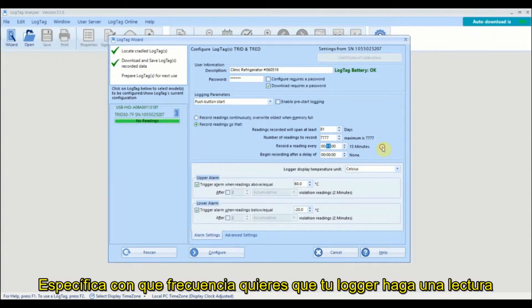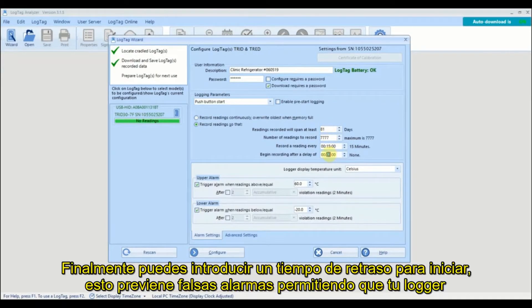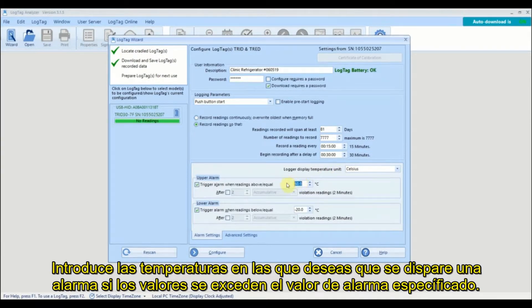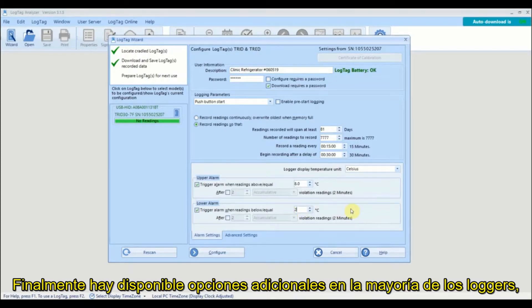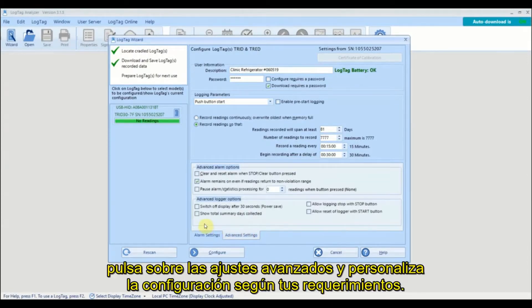Specify how often you want your logger to take a reading and the maximum number of readings the logger can take will be displayed. Finally, you can enter in a start delay. Adding a start delay prevents false alarms by allowing your logger to adjust to the refrigerator or freezer temperature before recording starts. Enter in the temperature values that will trigger an alarm if readings exceed the specified alarm temperatures. There are also additional options available on most loggers by clicking on a tab and customizing the settings to meet your requirements.